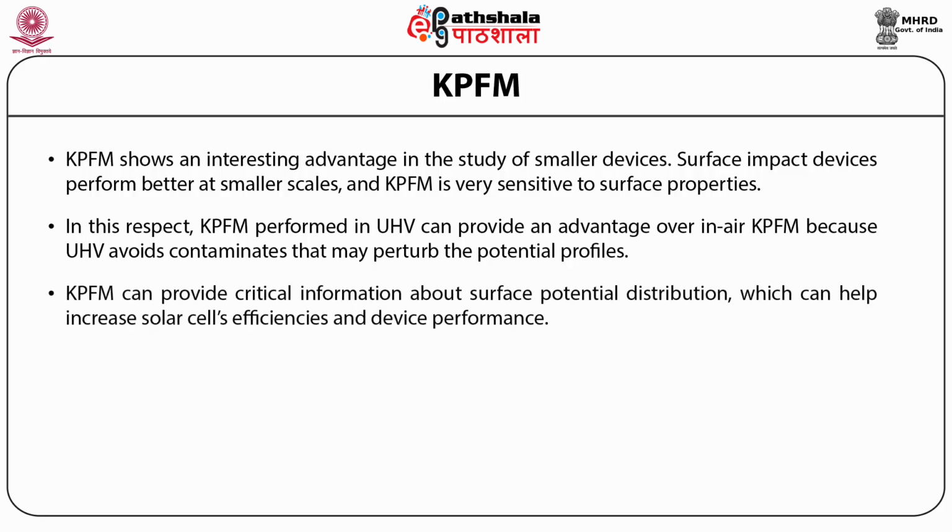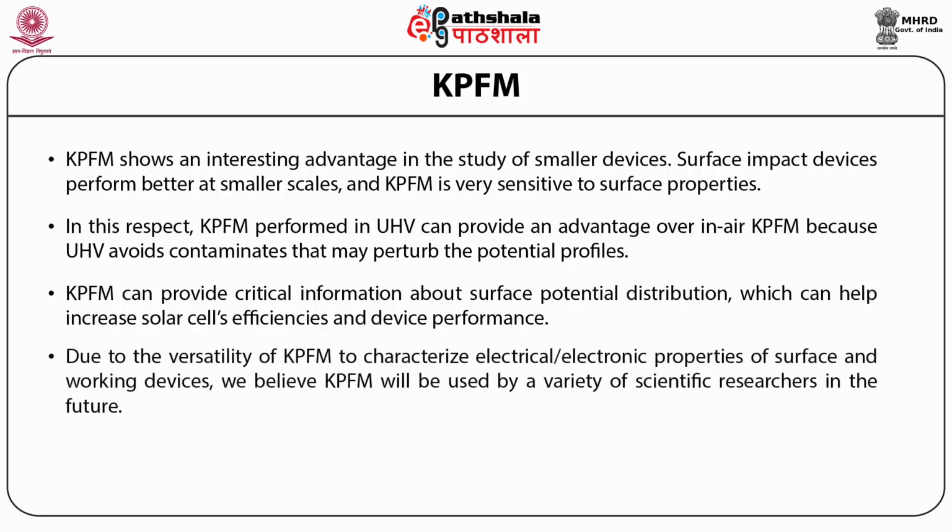KPFM can provide critical information about surface potential distributions, which can help increase solar cell efficiency and device performance due to the versatility of KPFM to characterize electrical or electronic properties of surfaces and working devices.